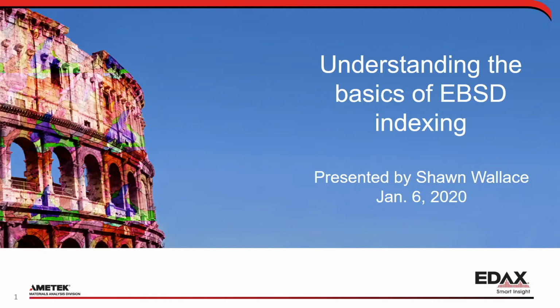And let's go ahead and actually show you some of these. So this right here are good patterns. If you showed me these, I would be like, oh yeah, these are all fine. Let me go ahead and find my little pointer here, turn on my laser pointer. So here you should be able to see my pointer now. Here you can see this is a low noise pattern.